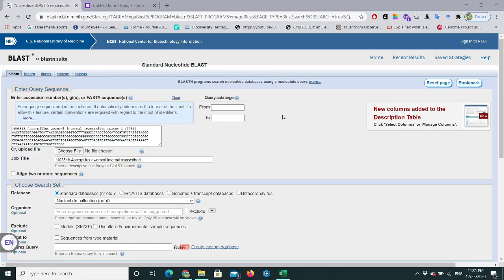Hello everyone, welcome to this NCBI session. Today I am going to talk about one of the most important parts of NCBI, called BLAST analysis or BLAST search. We use BLAST analysis to find similarities between different kinds of sequences, either nucleotide sequences or protein sequences. Today's lecture will focus specifically on nucleotide sequences, for which we use a special type of analysis called BLASTN.